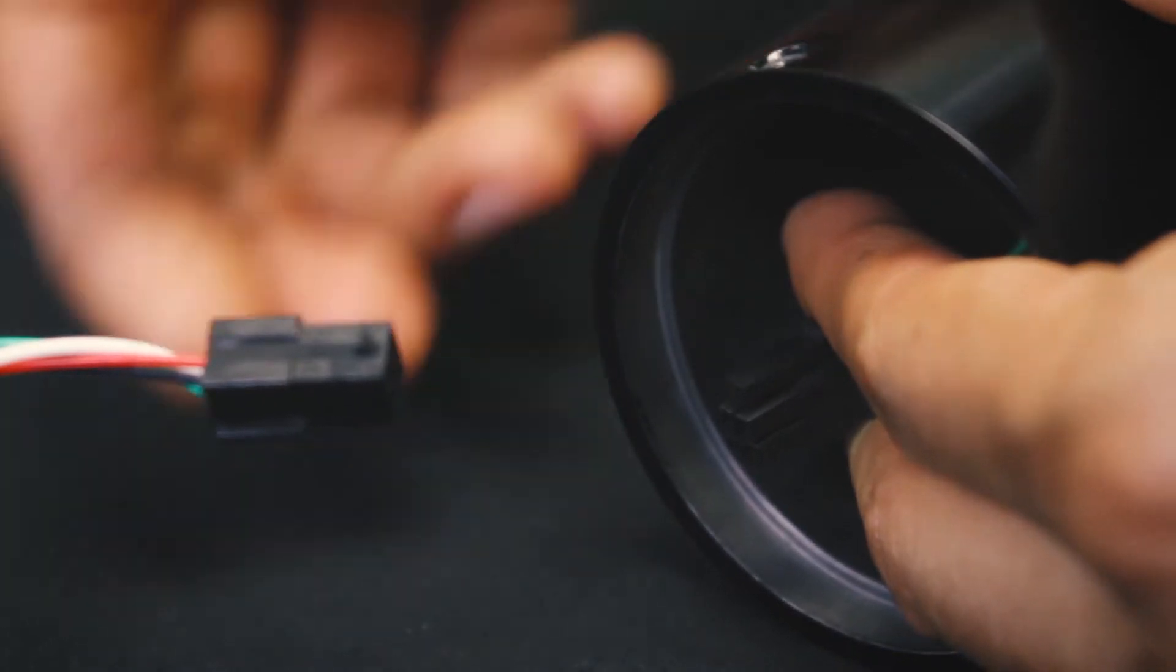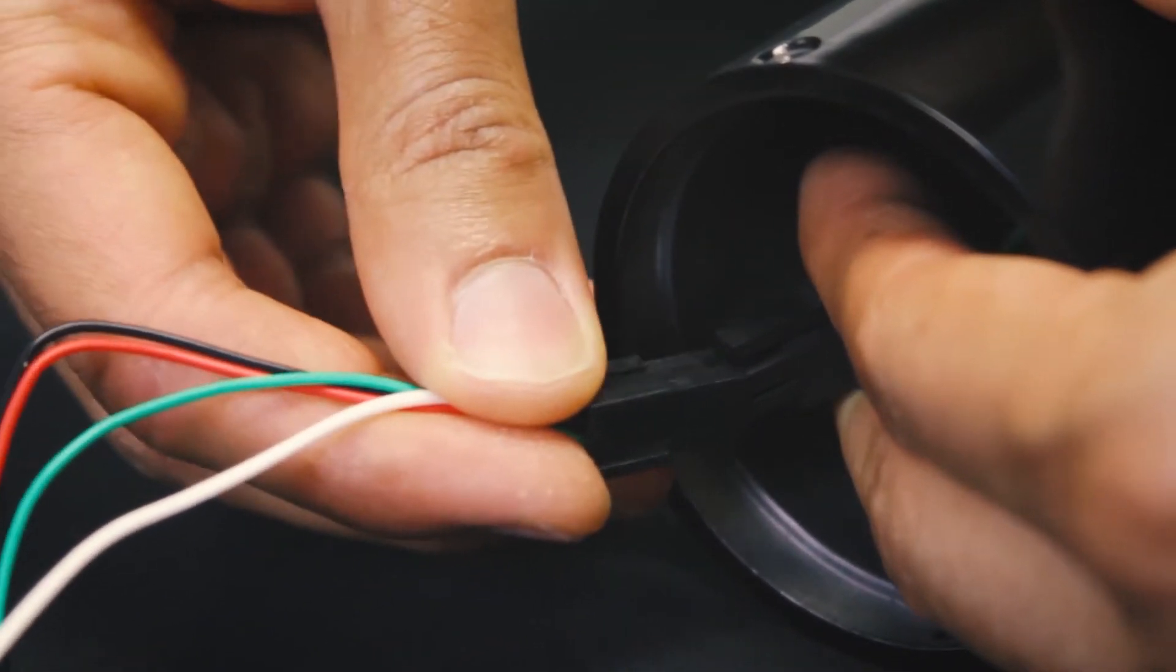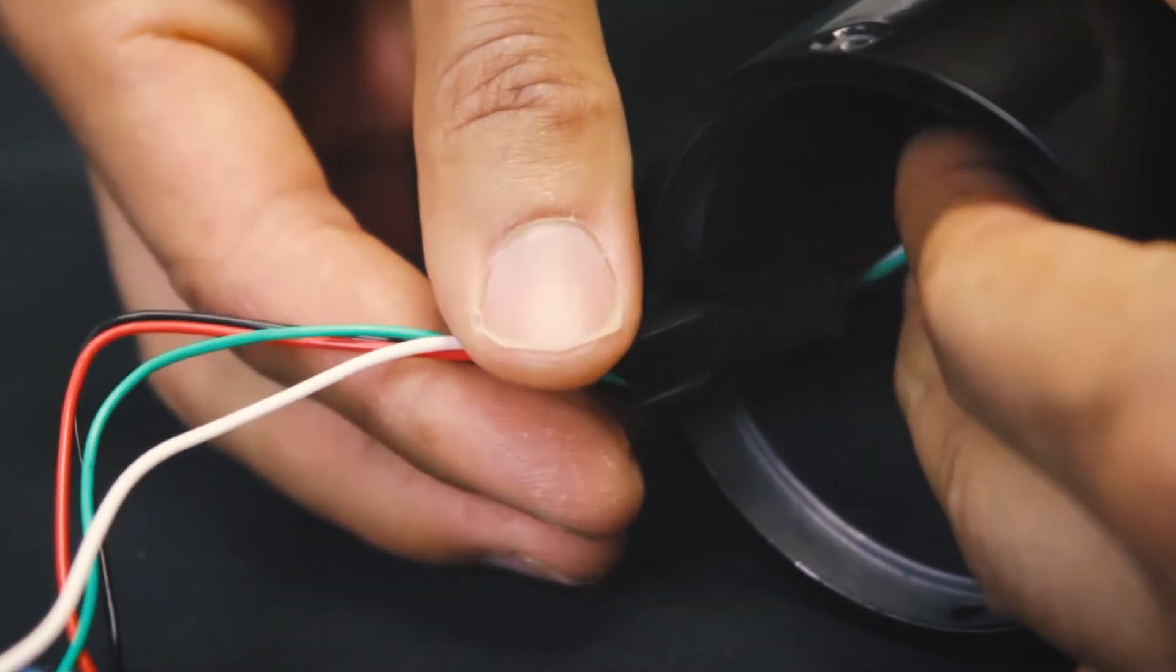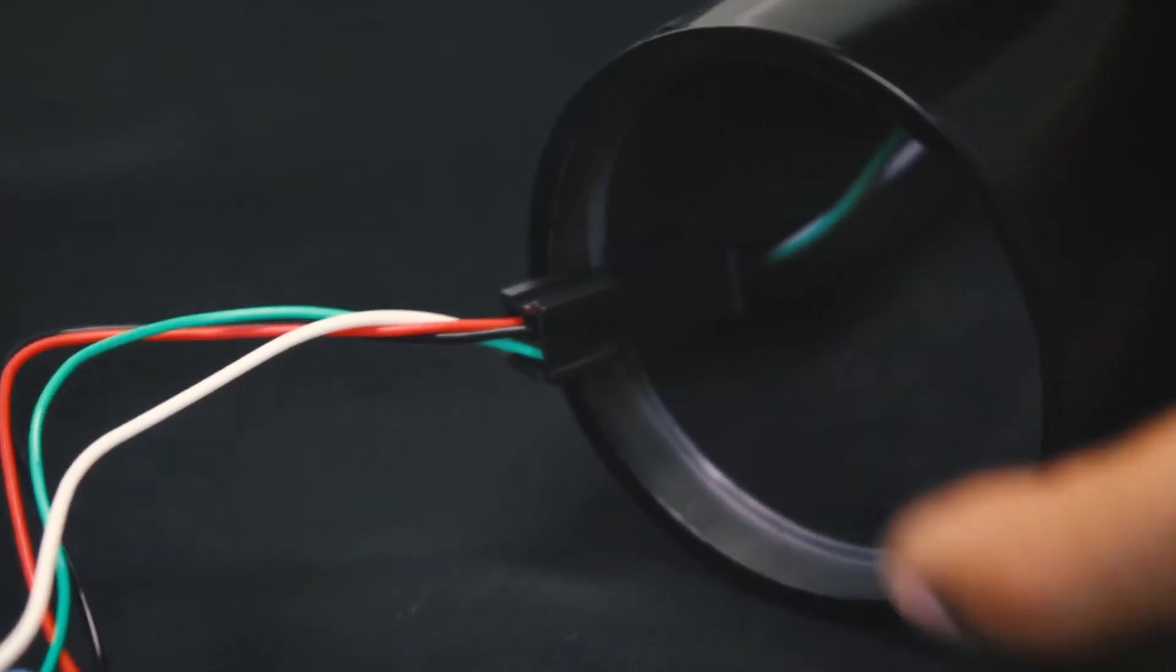Reconnect the motor wire assembly from the motor housing to the motor head. There should only be one configuration for clipping the motor wire assembly together.